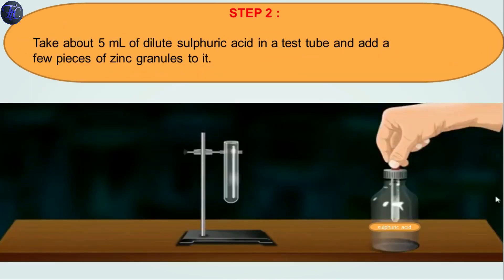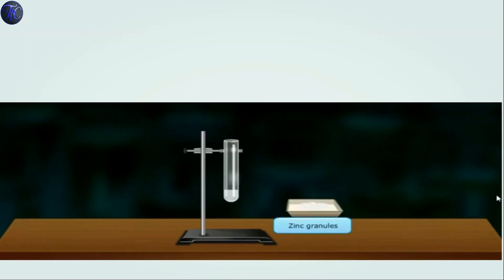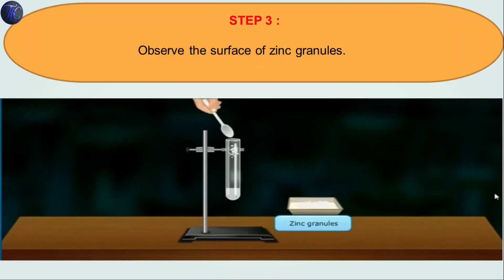Step 2: Set the test tube on the test tube stand and with the help of a dropper, add 5 ml of dilute sulfuric acid in the test tube. After adding dilute sulfuric acid, add zinc granules in the test tube. Observe the surface of the zinc granules.